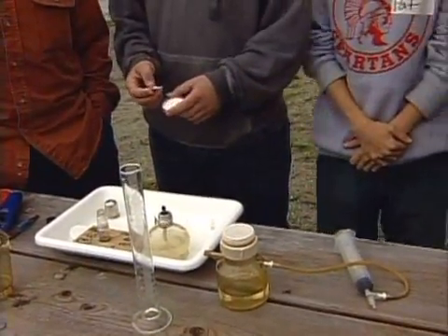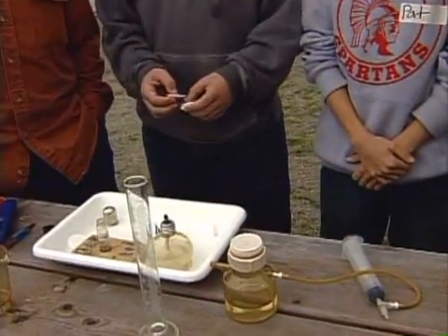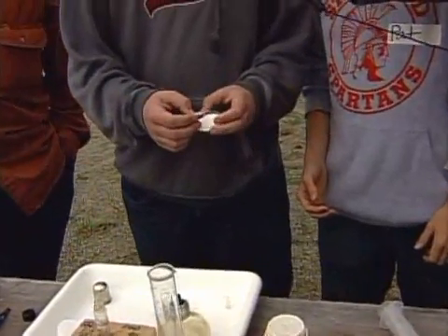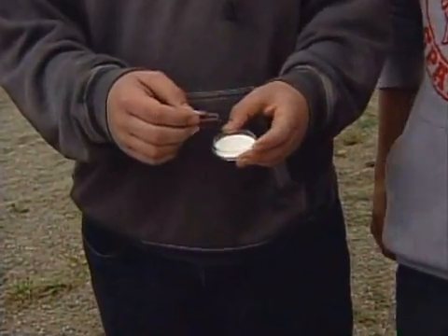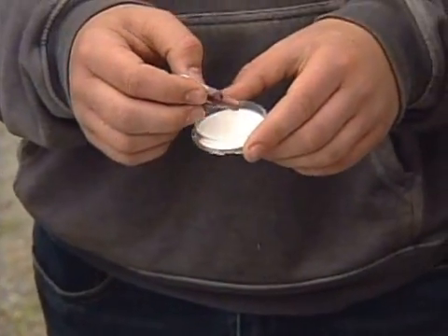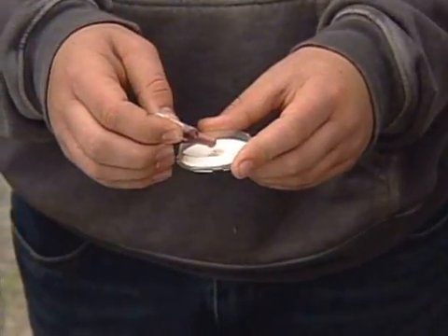So there's the filter. We've got the filter paper ready now. What's next? Steven, you want to show them? We're gonna put this dye onto the paper so it covers it up, and then we're gonna slide the piece of paper onto the petri dish. Okay. So go ahead and put that in there.